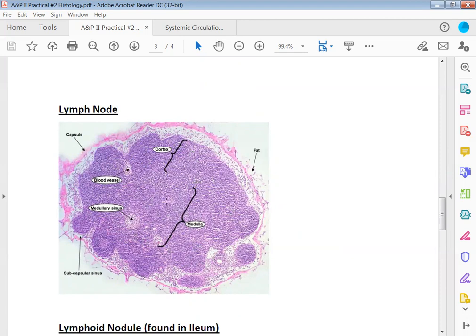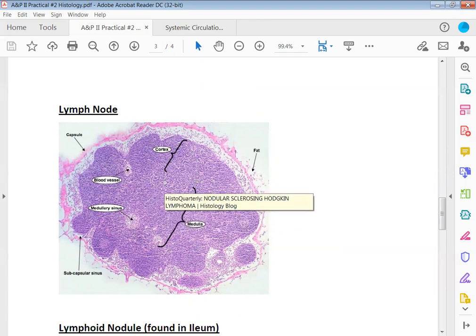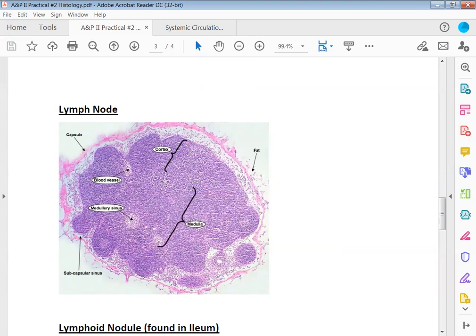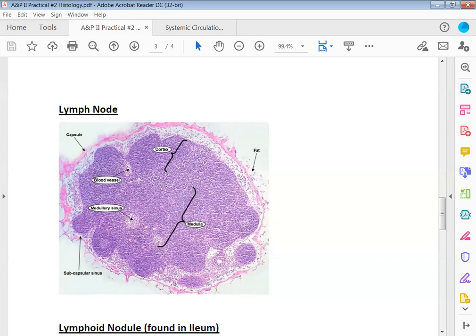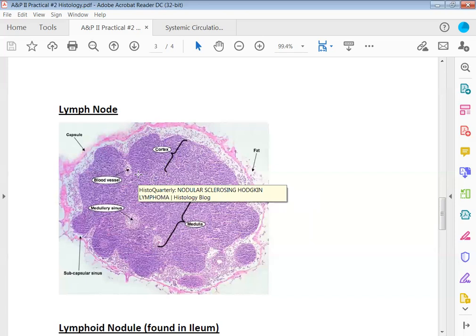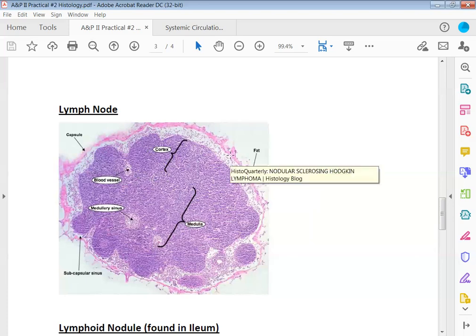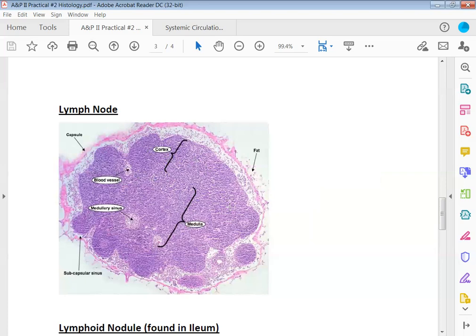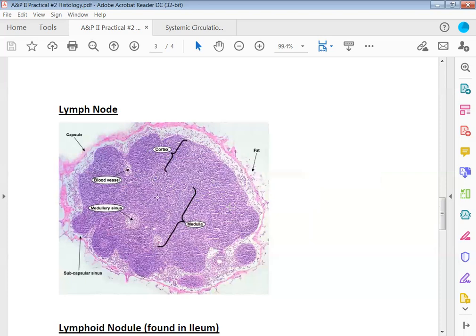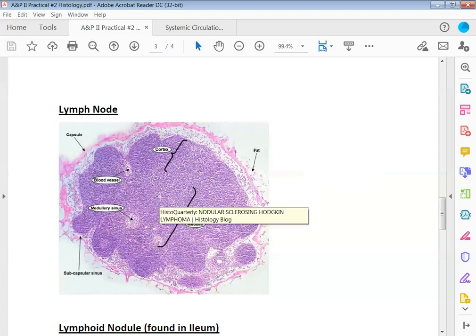On a practical, if I asked identify this organ or gland, you would tell me a lymph node. Identify this structure here would be a capsule. Identify this layer would be the cortex. And identify this layer in the center would be the medulla.